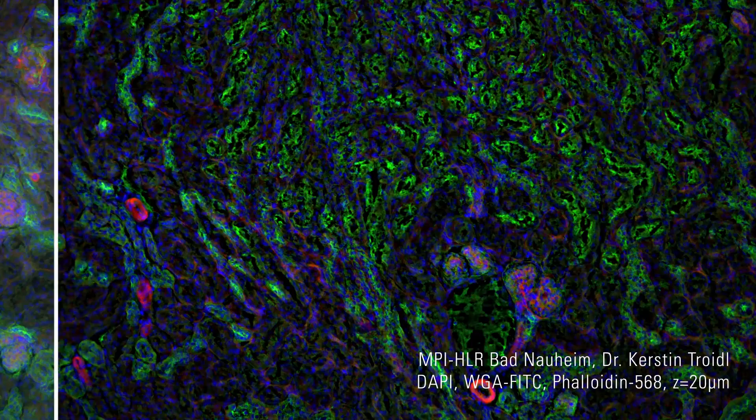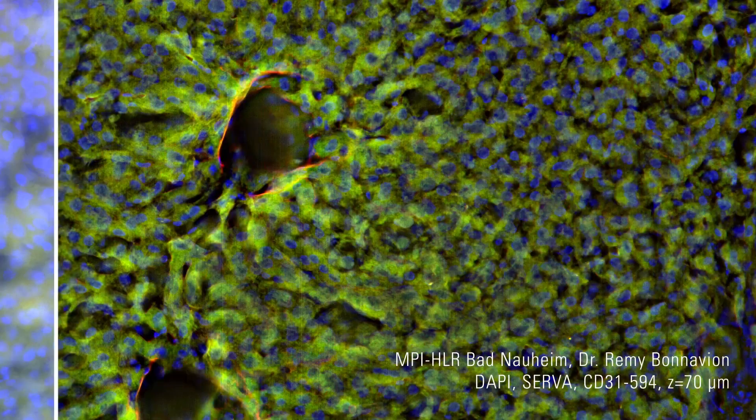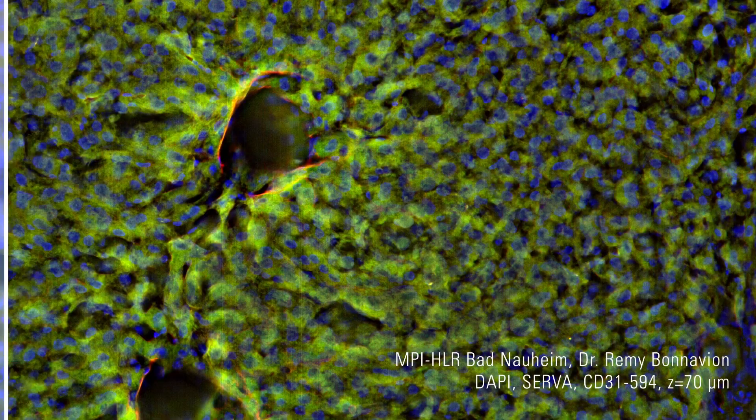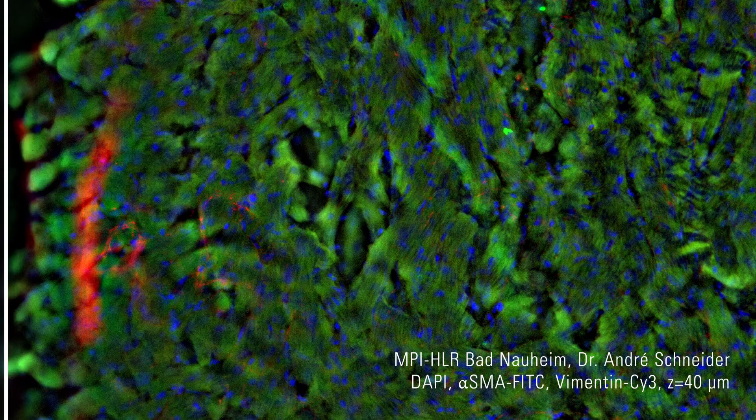Our Thunder Imagers enable you to decode 3D biology in real-time, whether you use kidney sections, liver, heart, or brain.